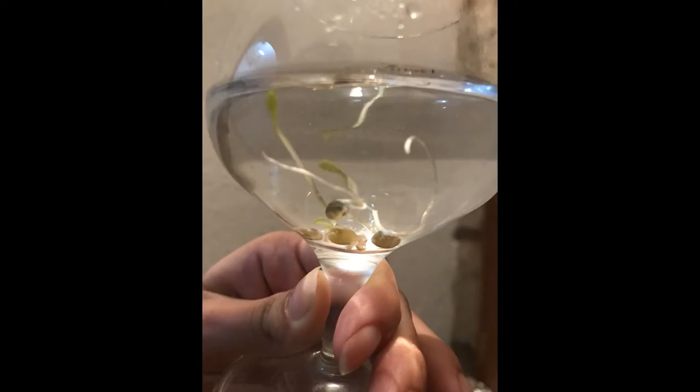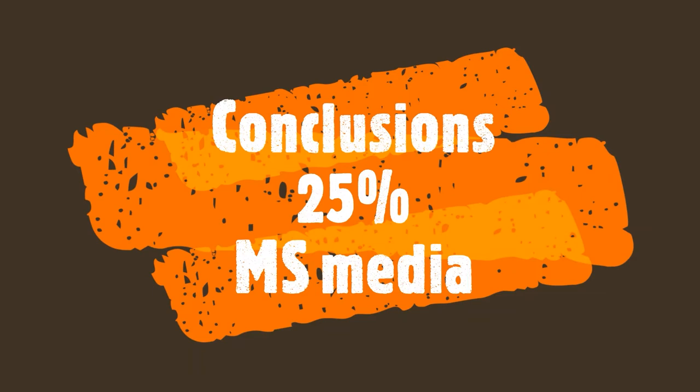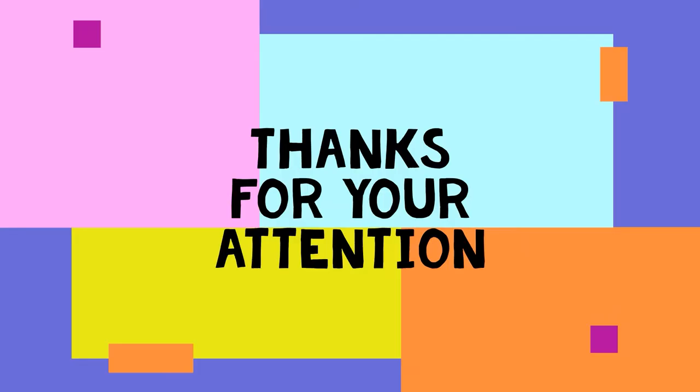After 4 days, to avoid more contamination, I decided to start the transplantation process. Conclusions: only 25% of the seeds germinated accurately. The MS media were definitely more effective than the one with potato water, and with this protocol it's possible to get a successful micropropagation.